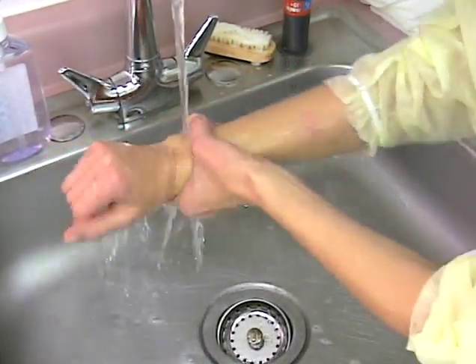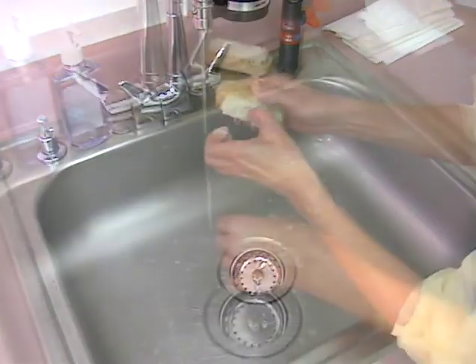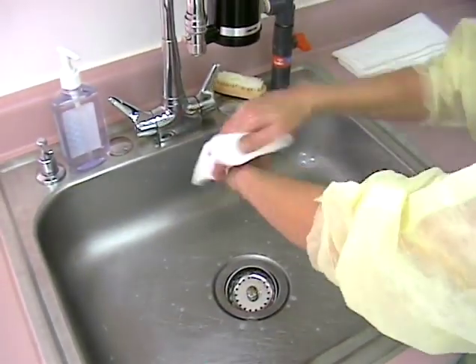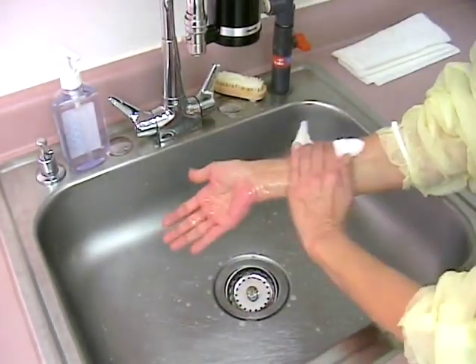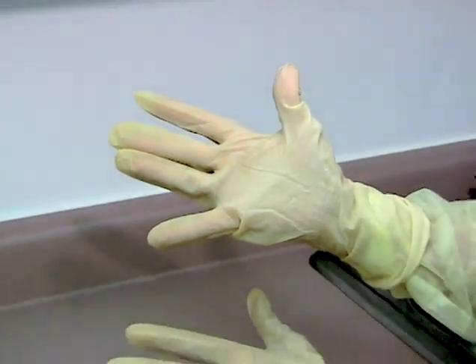Initially, the hands should be washed and the fingernails cleaned with a mild soap. They should be rinsed thoroughly and dried completely using a clean towel. The gloves should fit each operator properly to assure complete dexterity. Ill-fitting gloves will interfere with good manipulative technique.